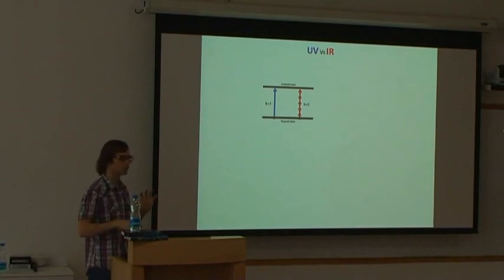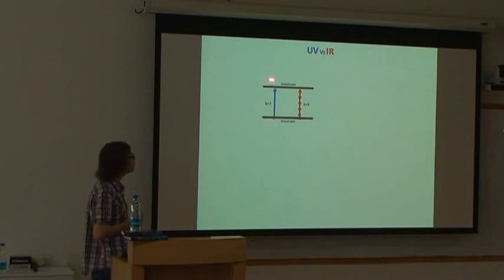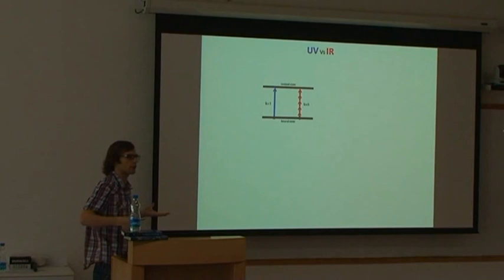It depends on the question you want to ask, and then on the experiments you want to do. So here, the main difference between UV and infrared when you want to do laser dissection. UV, as you know, is a photon which has more energy. That means that to send an electron from its bound state to its ionized state, you just need, for example, one photon. If instead you want to use infrared, you will need more photons. So at first, if you look at it like this, you would say, okay, then UV is probably better because you need fewer photons.